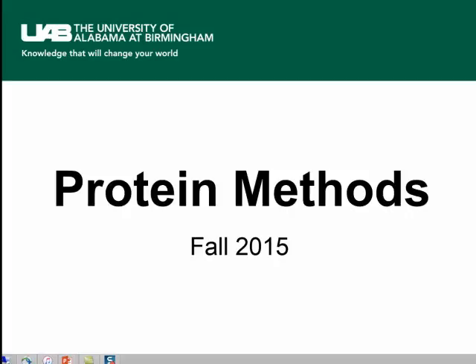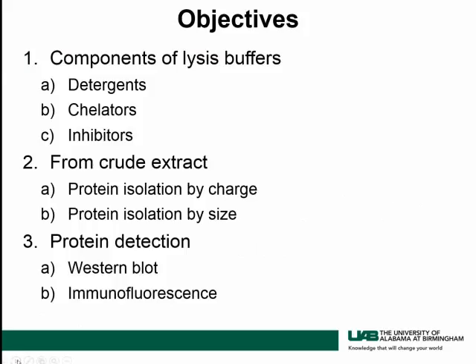Today we're going to study some of the methods that are used for protein isolation and protein detection. Our objectives are as follows. Number one, we're going to look at the components of lysis buffers such as detergents, chelators, and inhibitors.